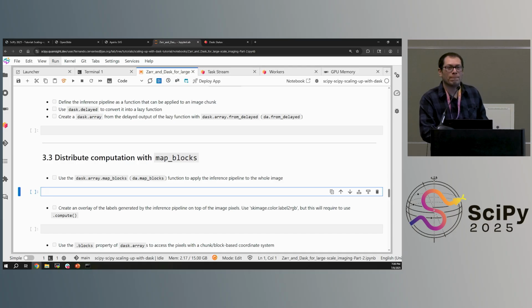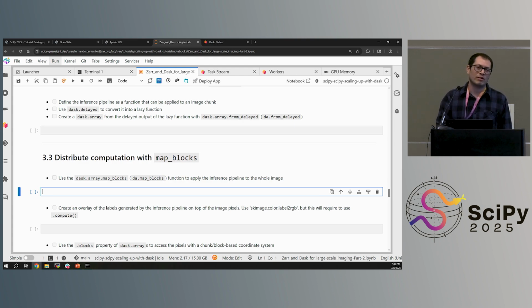Quick question. Can you quickly discuss what's the difference between the OME TIFF versus the regular TIFF file? Yeah. So the OME format is a specification that must contain specific metadata information for your image to make it an actual OME TIFF file. Otherwise, you can just store an image in the TIFF format without any metadata. This is just going to make it a regular image file. But then the idea is that if you want to get access to the information about where that image comes from or what it contains, it is very helpful to have this metadata information.